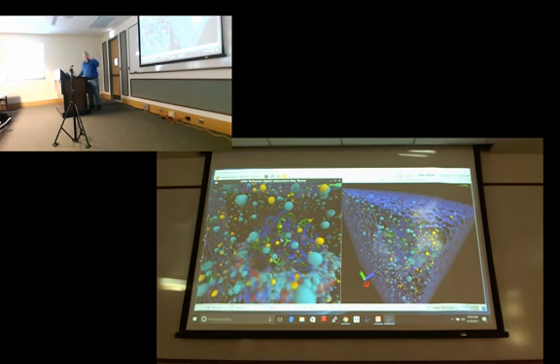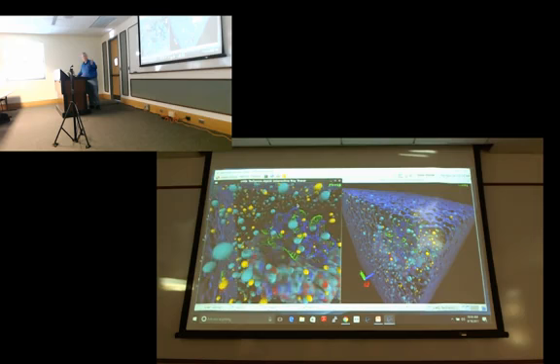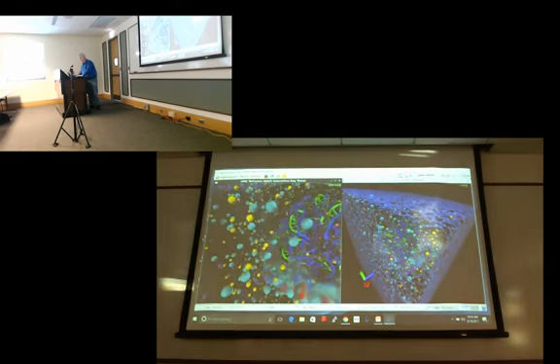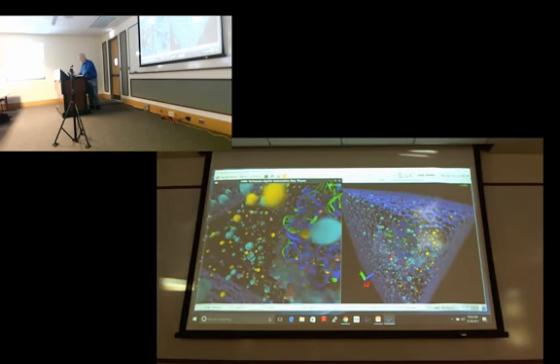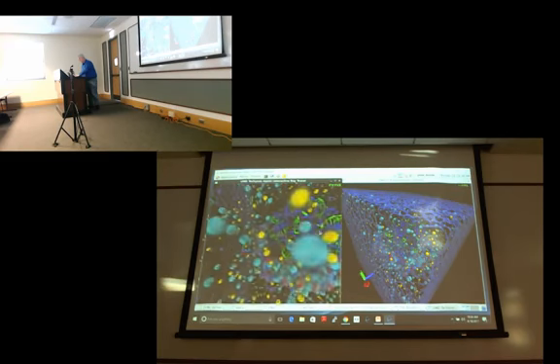Now, obviously my little puny laptop that cost me $280 doesn't have the hardware to do this kind of rendering that fast. But it can do a decent job with a simple scene, or a structure that's not quite that large, just using the CPU. And so our goal in developing this feature in VMD is to support both the best stuff like your GPU-accelerated NVIDIA cards, but also your typical run-of-the-mill x86 laptop.